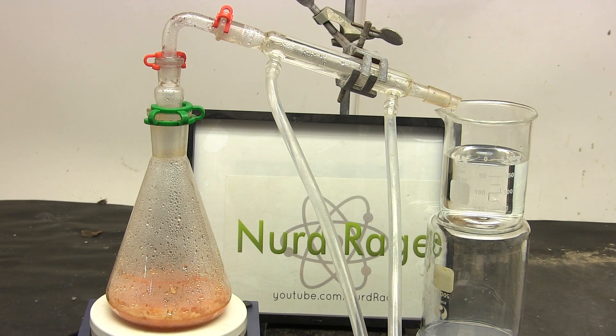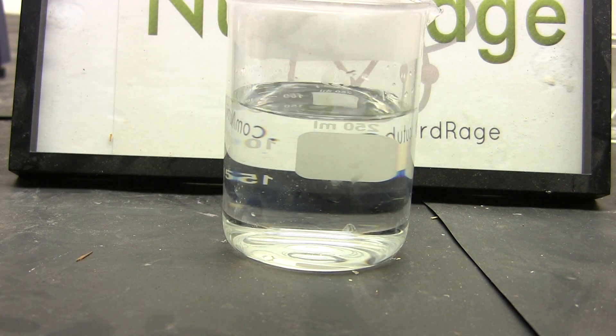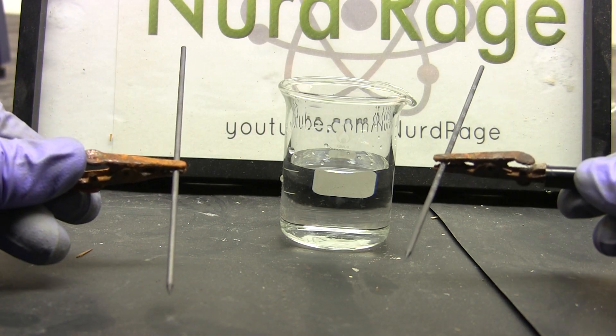Just distill all the way to dryness. This is our solution of distilled hydrobromic acid. To test your acid, get a small sample and stick in two carbon electrodes.